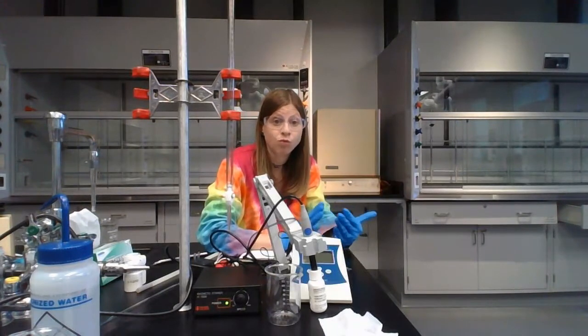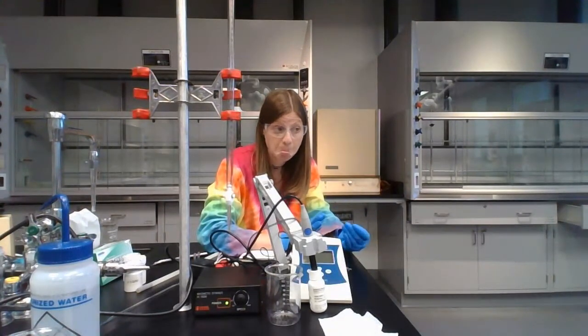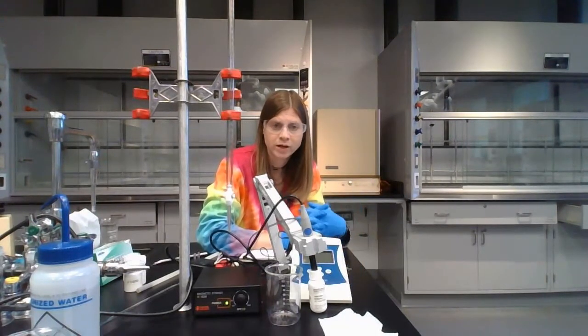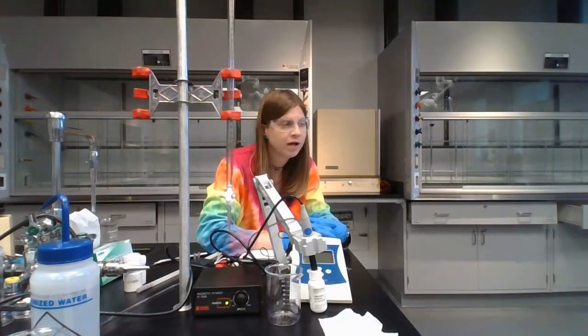You can have one giant waste container. That's not a problem. So you can get like a 1 liter beaker and mix all your solutions in there, and then you will have to neutralize it to a pH of 6, 7, 8, or 9, and then it gets dumped down the drain, and then you can wash your glassware like normal.